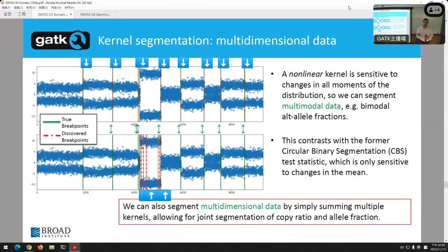And it gets complicated. I just want you to go back in your head to the original picture of chromosome 4, where that 4th copy only had a fractional duplication. So sometimes you go from copy ratio 4 to 3 to back to 4, back to 3. It's all over the place. So we need to figure out exactly where those shifts are happening.